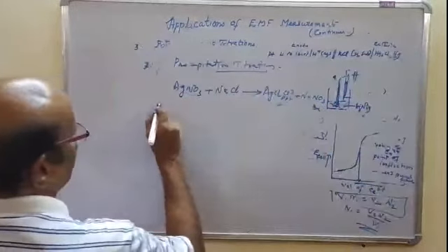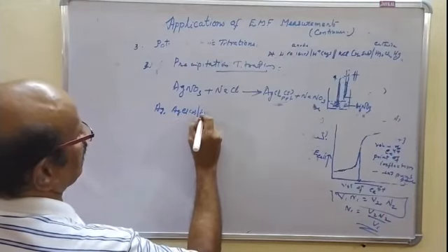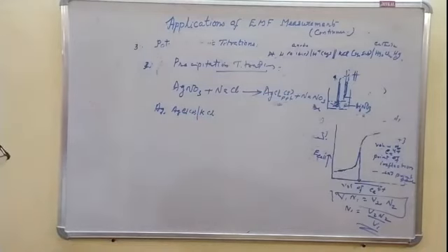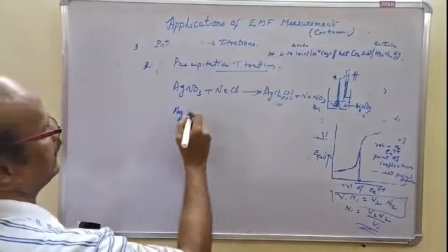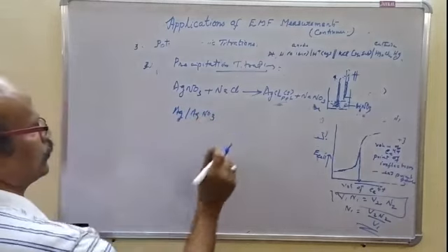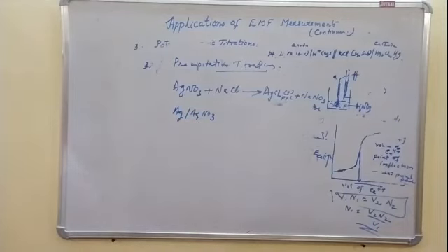The silver electrode acting as the indicator electrode is dipped into the silver nitrate solution, which is then connected to the saturated calomel electrode.